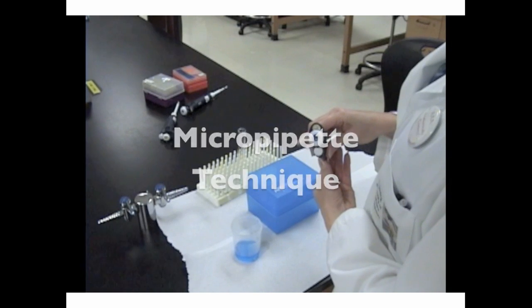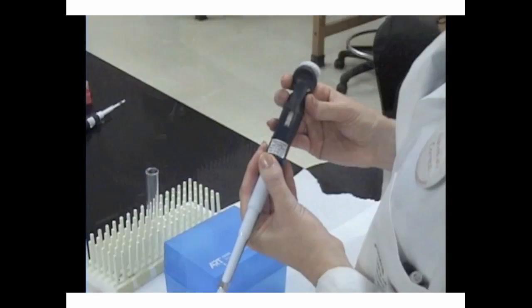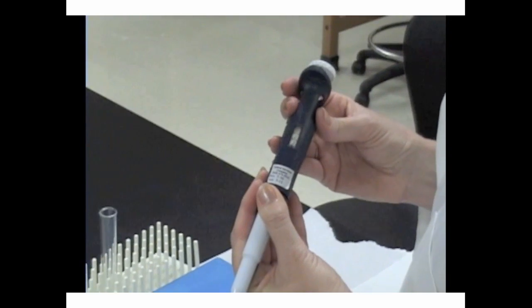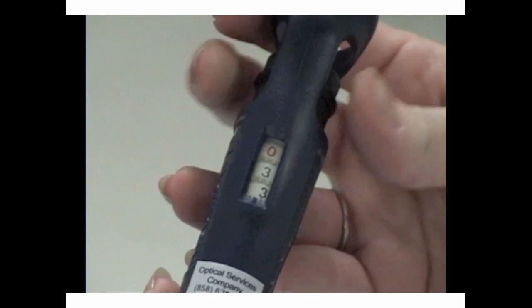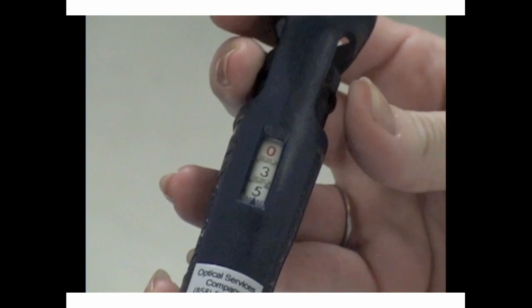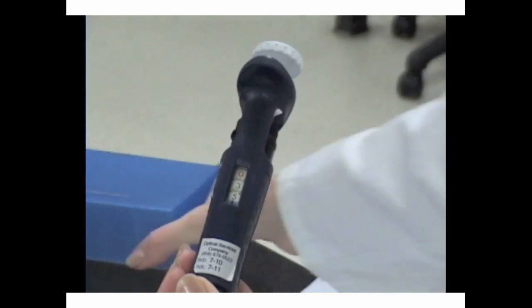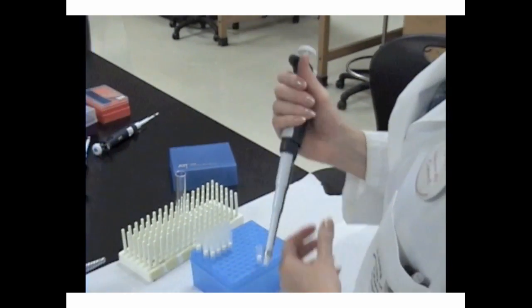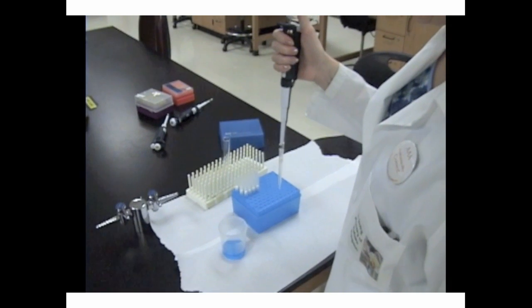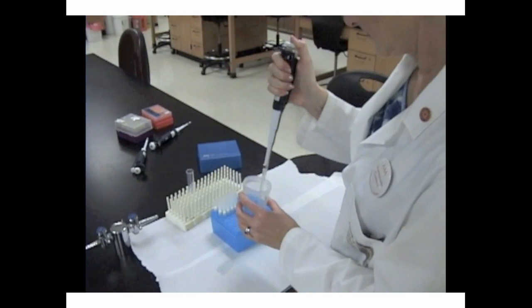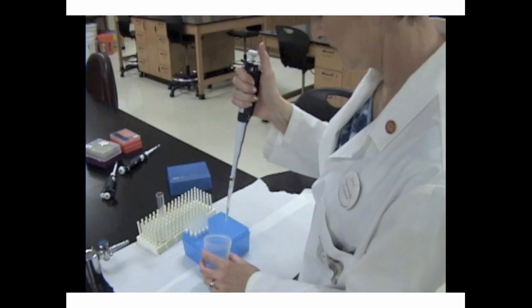So, here I've got my P1000 micropipetter and now I'm going to make sure that the volume is set to what I want. So, I'm going to dial in my desired volume. And you can see here that this is going to dispense a volume of 350 microliters as I've set it right now. Next, you're going to get yourself a tip. Make sure you're using the right tip for your micropipetter. I'm going to depress the plunger. And then I'm going to take my sample and then slowly release the plunger and that's going to pull up my 350 microliters.